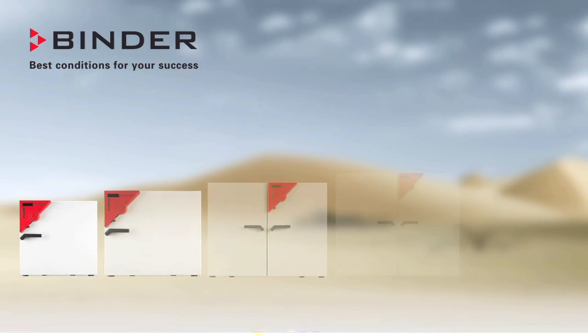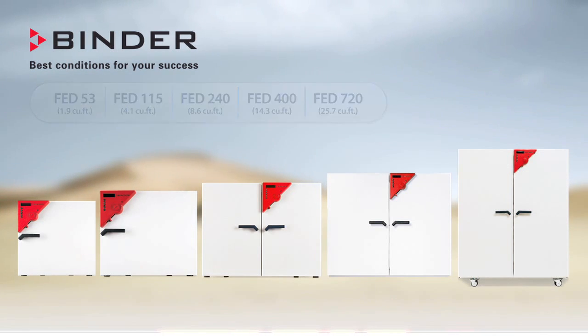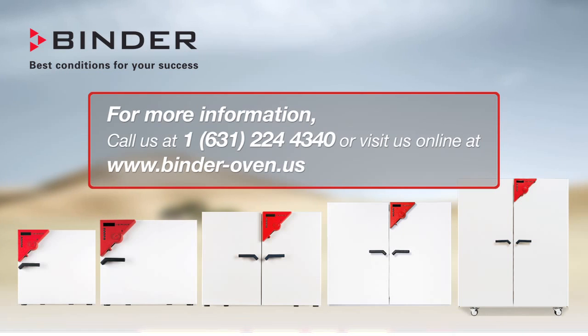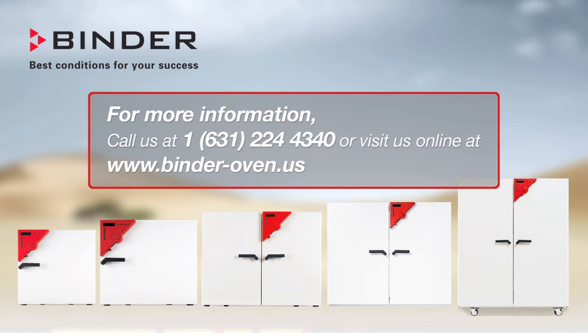Whatever your application may be, Binder has an oven that will meet your needs and provide superior performance for your investment. For more information, contact your Binder representative today or go to www.binder-oven.us. Binder — best conditions for your success.